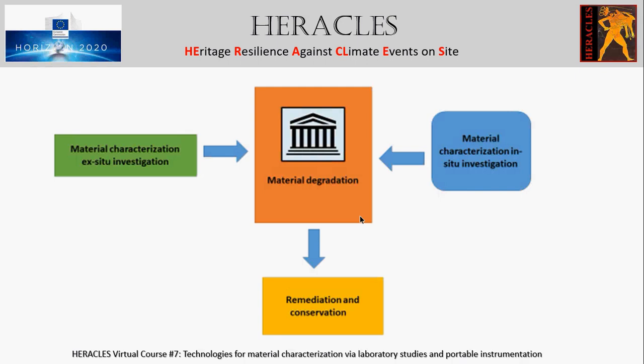The next step for many materials is the microscopic examination using the ex situ analysis. So the selection of the ex situ analytical method or technique is dependent on type and value of the sample, the sample matrix, the precision and sensitivity of the instrumental measurements technique, and the availability.